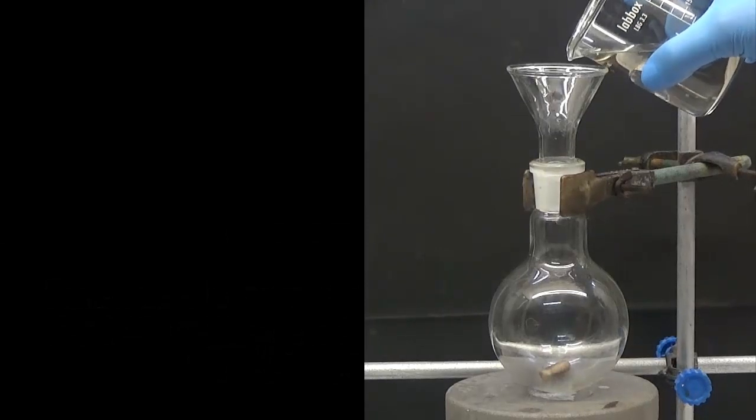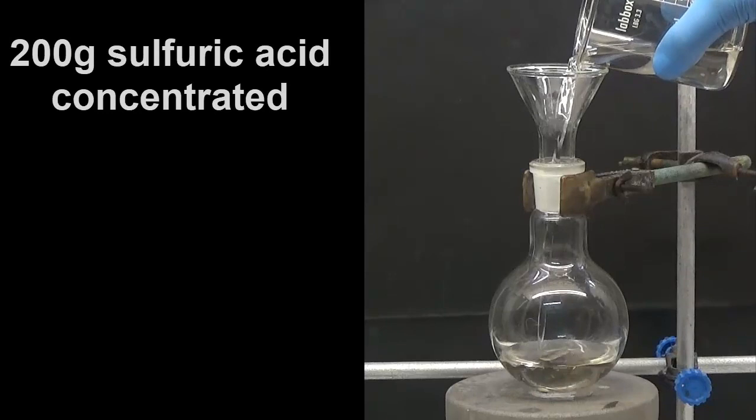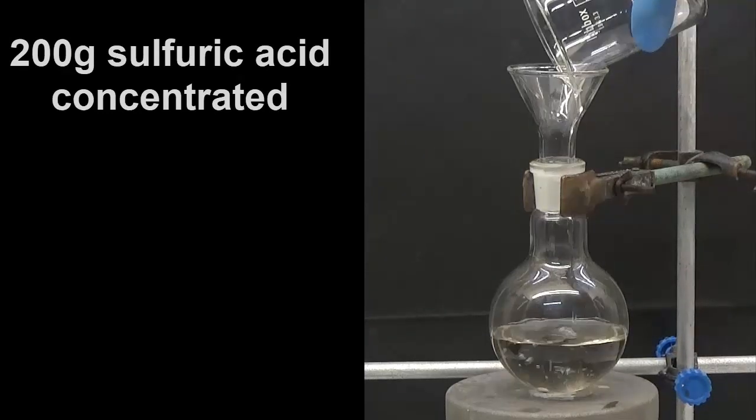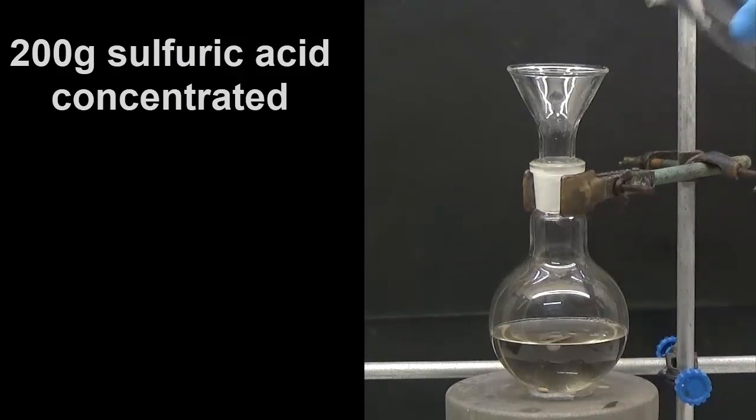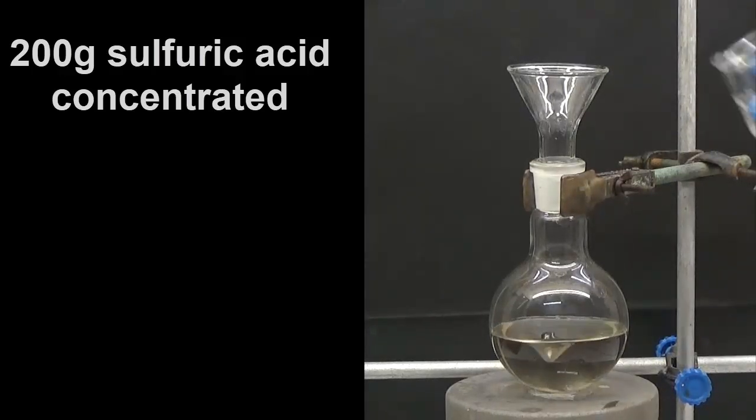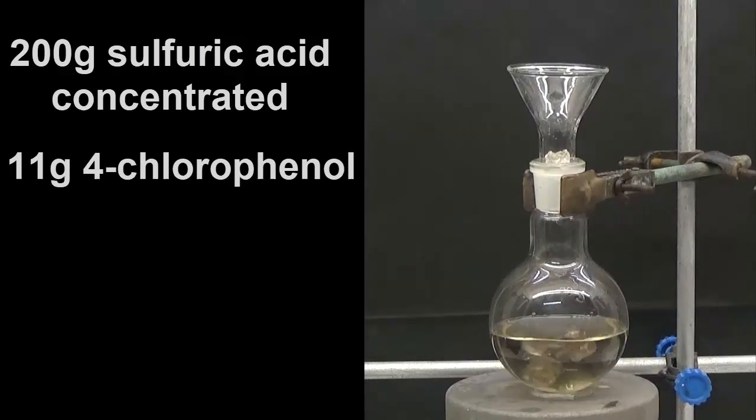To proceed with its preparation, put 200 grams of sulfuric acid in a 250 ml flask. With stirring, add 11 grams of 4-chlorophenol.